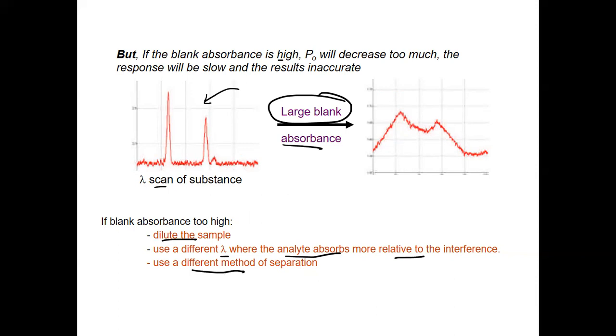Okay, so if you use chromatography with UV detection, most likely you will get that. And if ever there are other samples, there's just another peak that you have. All you need to do is determine the retention time of the target analyte that you're looking for.